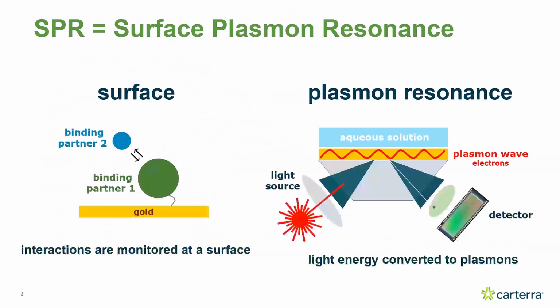However, there's an angle, the SPR angle, at which photons are lost to this evanescent plasmon wave in that very thin gold layer. And the angle that occurs at is determined by the refractive index of the solution on the other side. So as we vary the angle of incoming incident light, we collect many frames per cycle as we swing through a fine series of angles of this incoming light source.